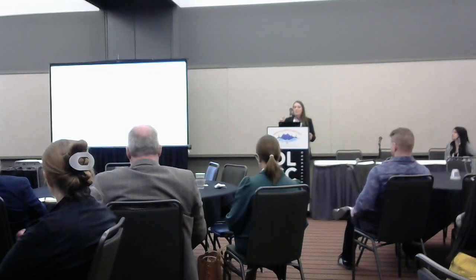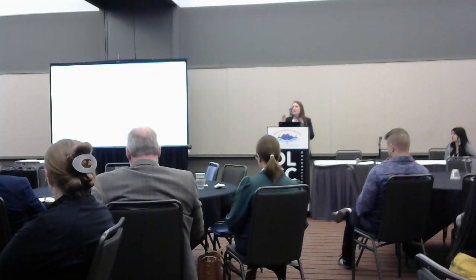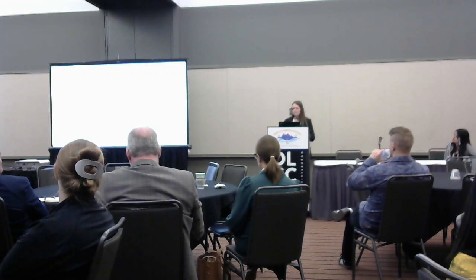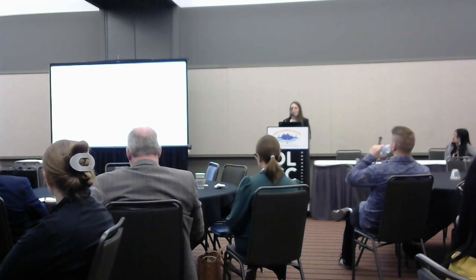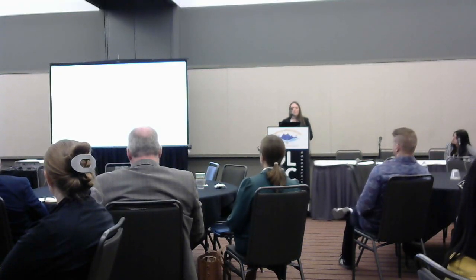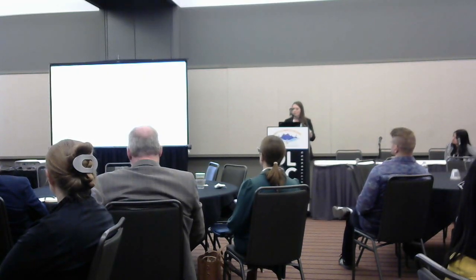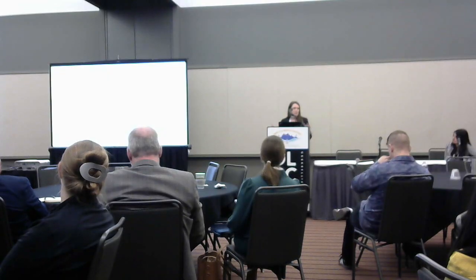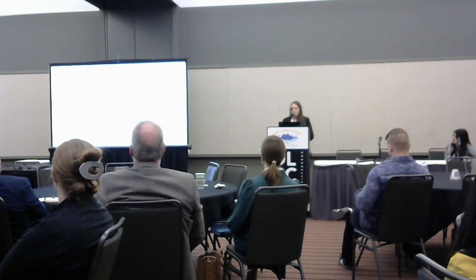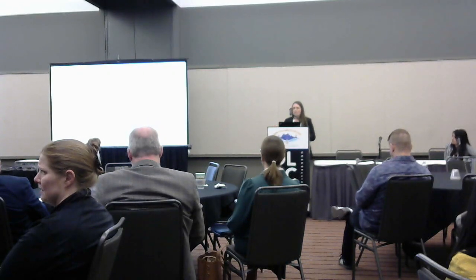past 2 years in a workshop environment and a short course environment where I tried to teach similar material. The first environment was an immersive workshop where we focused on introducing image analysis through ImageJ, a graphical user interface-based analysis software, open source, and Python. But the Python had no coding requirements. You didn't have to come in knowing how to write scripts or anything like that, just introducing tools to people at baseline to get them toe in the water, familiar with what's going on.